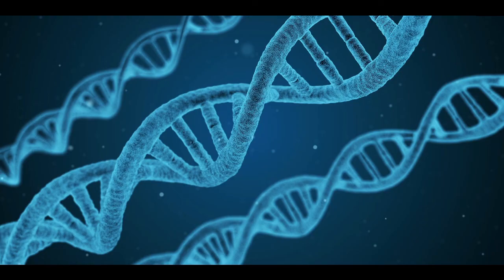We're also talking about the difficulty of getting a good sequence, and one of the important steps is doing the gel run after you've extracted the DNA. Megan, I know you're working a lot on protocols for this process. Could you talk a little bit about what can go wrong that makes the gel reveal that you didn't accomplish what you wanted to accomplish?